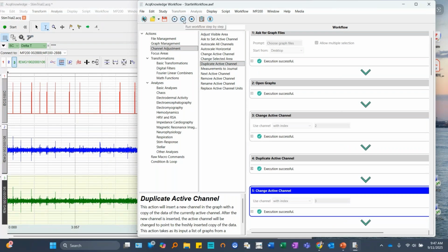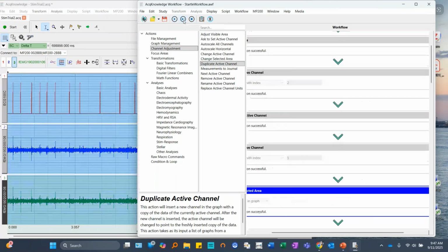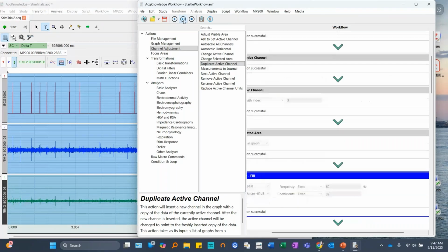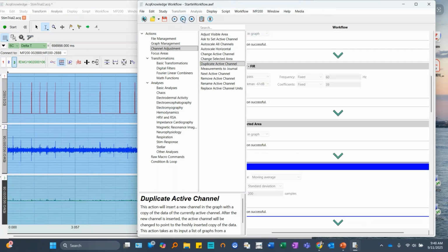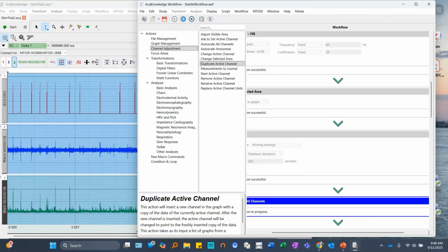We're going to highlight all of the data. We just filtered it. You can see the difference now between the initial raw data and this is the filter. They're going to, again, make sure that all the data is selected. We now just integrated it. We rescaled it.